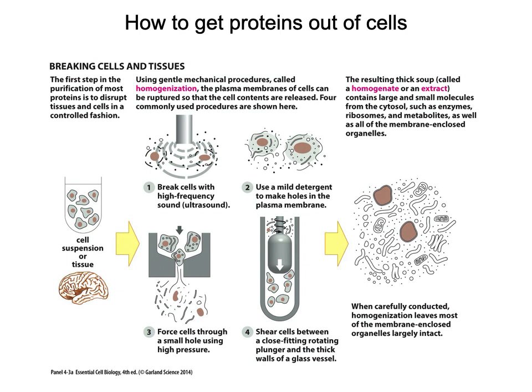The fourth method is where you would use a plunger, and by rotating that against a wall, because when it rotates, it hits the cells up against the wall, that causes it to lyse. Now, that plunger, the fourth method there, it's kind of like a mortar and pestle.